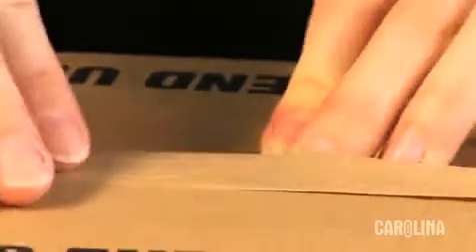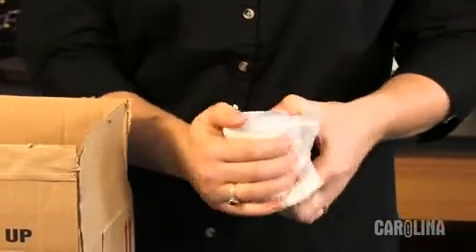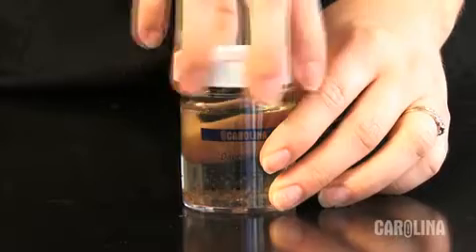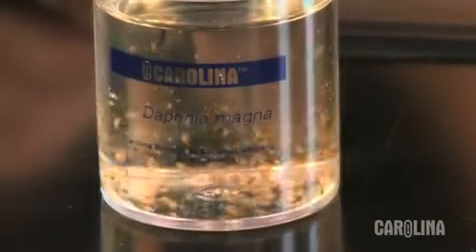Upon receipt of your culture, remove it from the packing materials. Wipe off any excess packing material. Remove the lid and replace loosely on top. This permits fresh air flow to the culture.